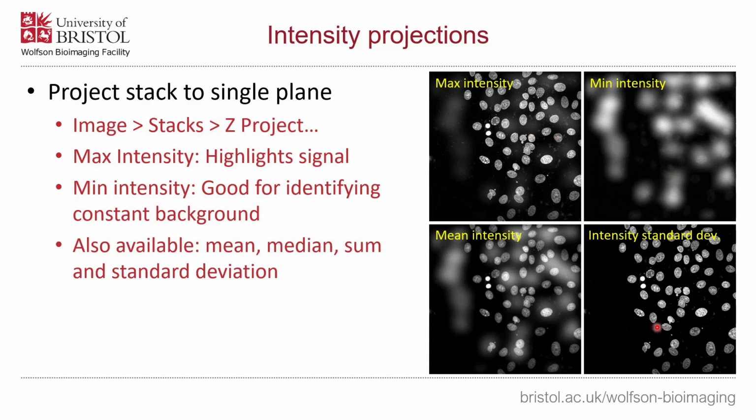And then just giving a couple of other examples here, like taking the mean of all pixels at each XY location or taking the standard deviation.